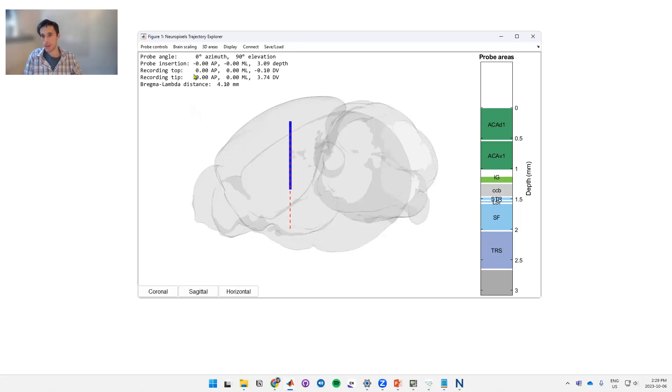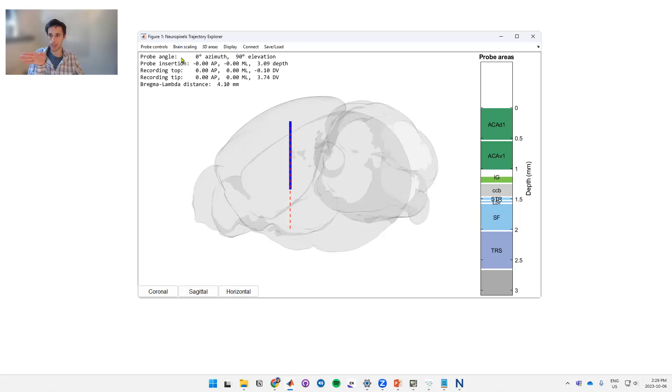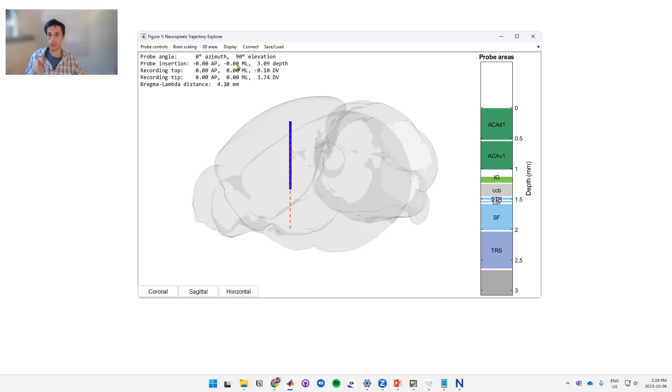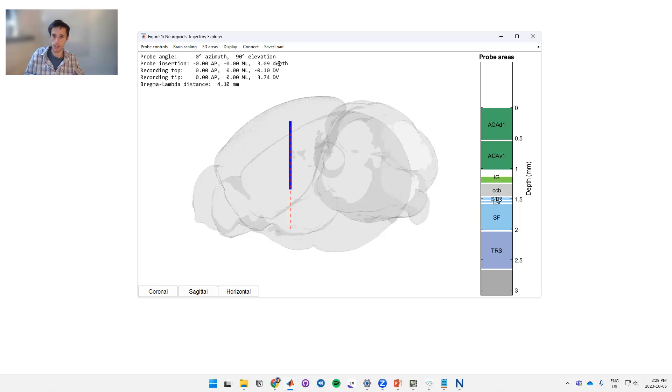Up here in the top left you've got some coordinates, so it shows the probe angle. This is azimuth left to right and elevation up and down. It shows the insertion point, which is the point and depth at which your probe intersects the brain. So these here are the coordinates AP and ML where you actually go into the brain, and this is the depth along that trajectory that you're going in. The next down here are the recording top and tip, so this is the top and tip of your NeuroPixels probe.